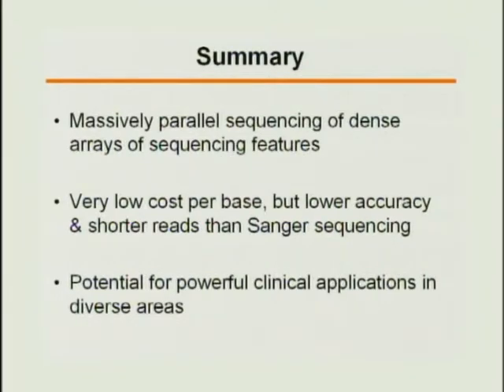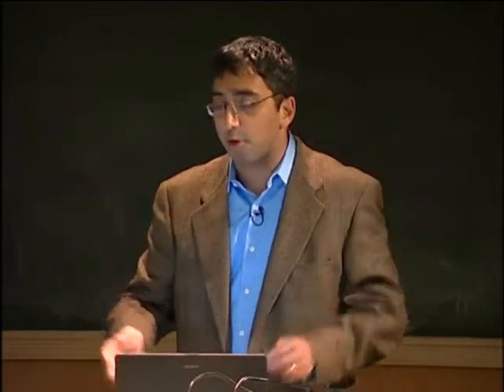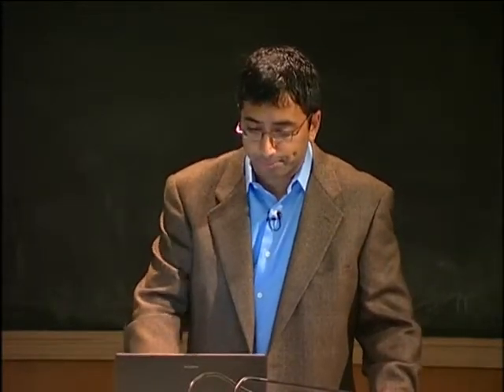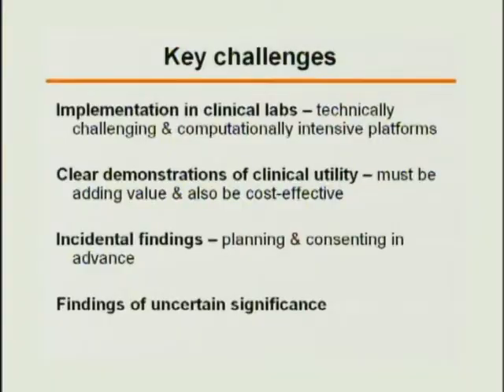And I think across these broad areas that I talked about, there's a lot of potential for clinical applications. Not necessarily in this idea of personal genomics, but in these other areas where the results might be achieved in a much more tangible and short-term way. Thinking broadly about the challenges that are going to be faced in actually trying to realize these in a clinical lab, implementation is obviously going to be a very large challenge.